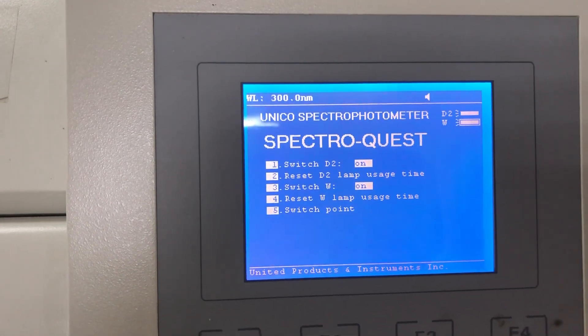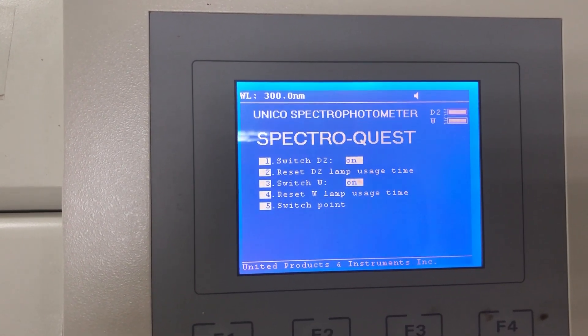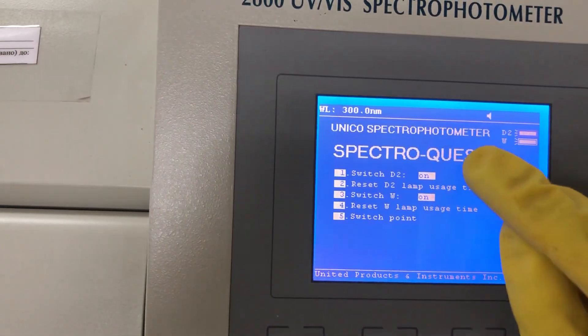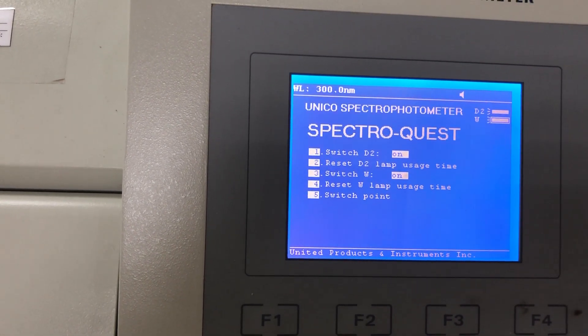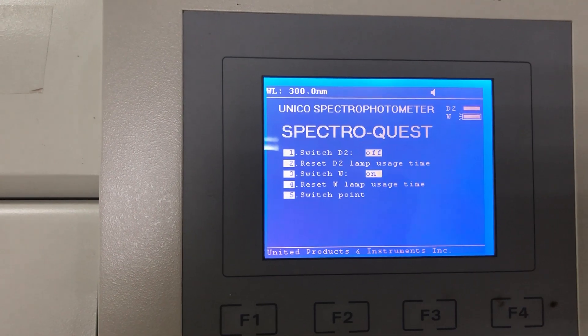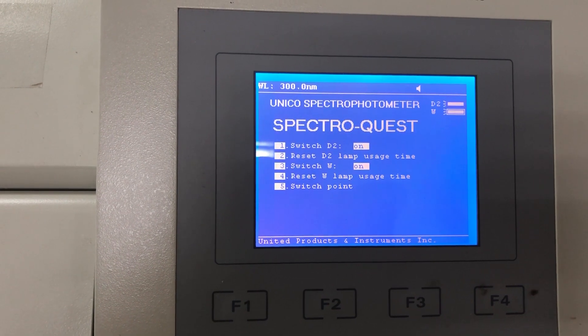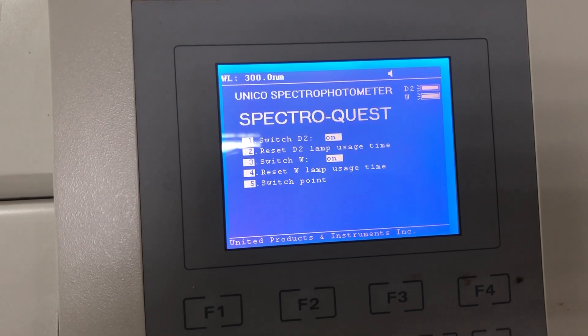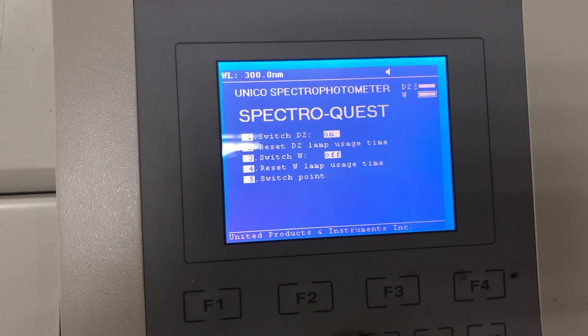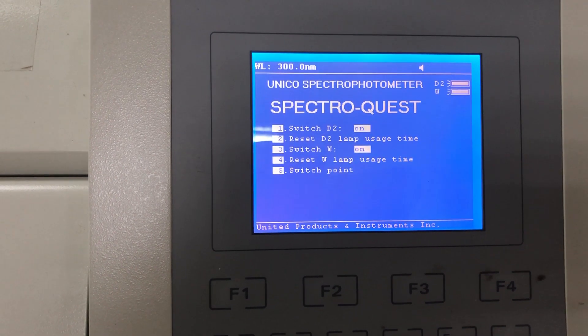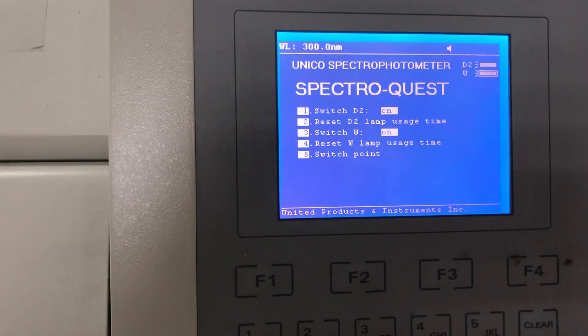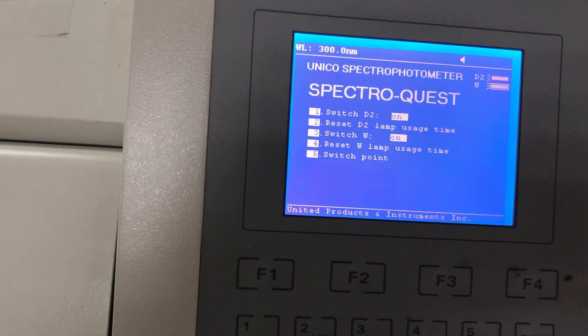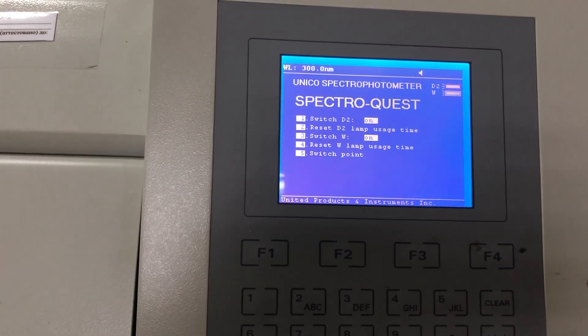You will find switch D2 on and off, reset D2, switch D1, and switch wavelength. We have here number one and number three, these are the most important. Press number one to switch D2 on and off. Press it to turn off, turn on, until the instrument gives you a good result. After that, we can press escape to exit this page.